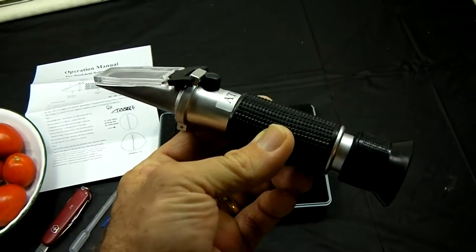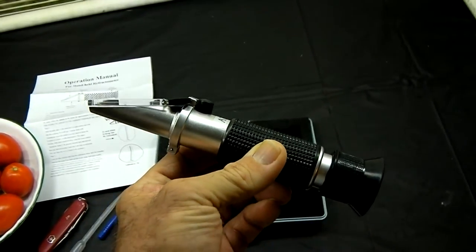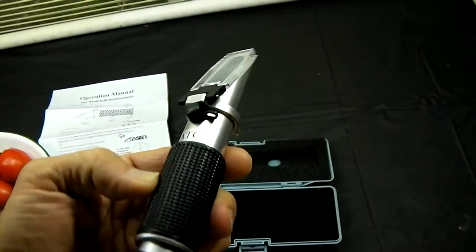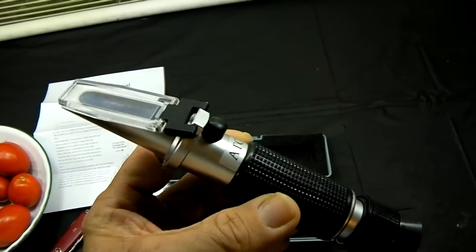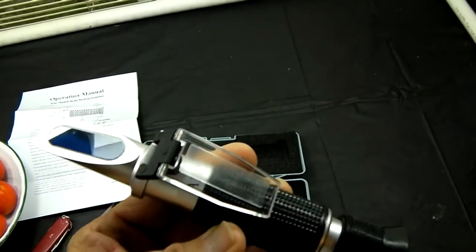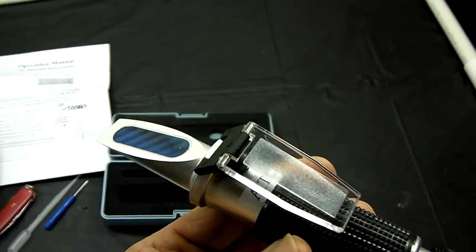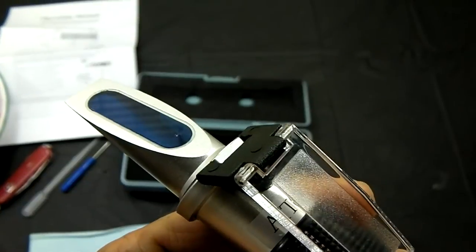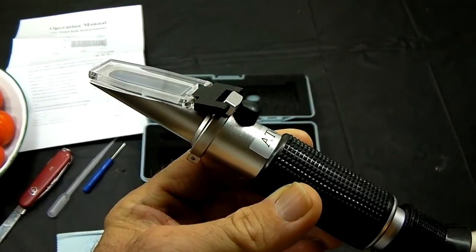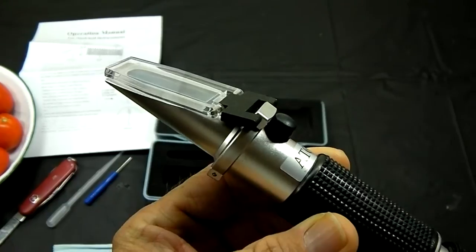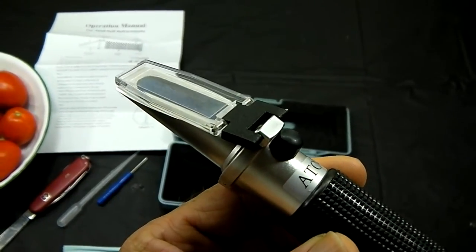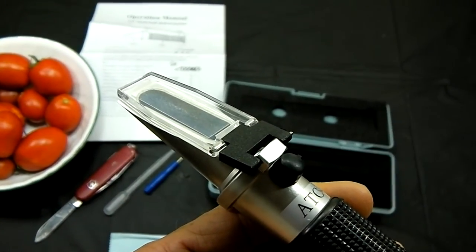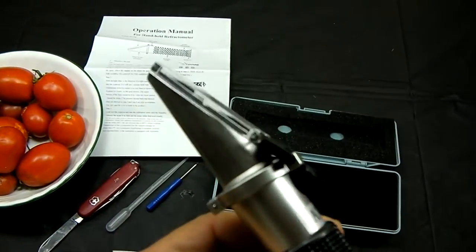This is what a typical Handheld Refractometer looks like. They all look pretty much the same, slightly different in style and construction, but they're all pretty much the same. You can see it's got a little window there. It flops open. You have a glass plate there. That clear plastic cover lets the light in through your sample, and it helps squish down the fluid to make a very thin film on that glass.